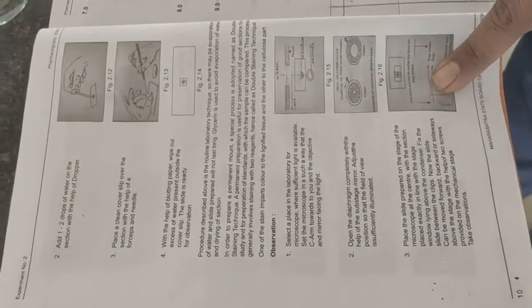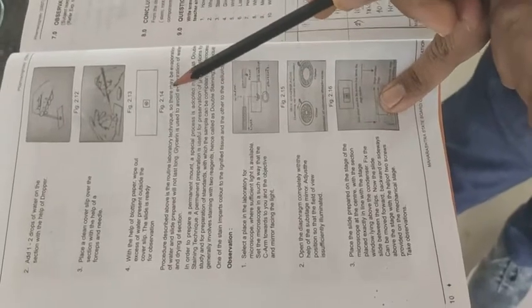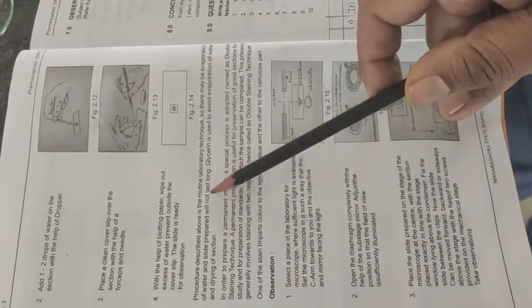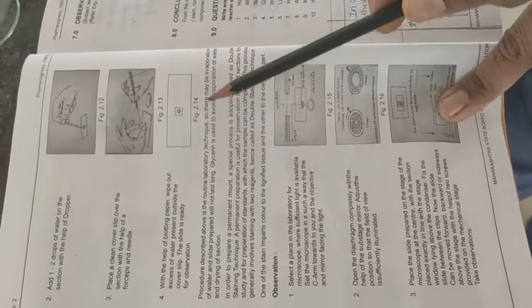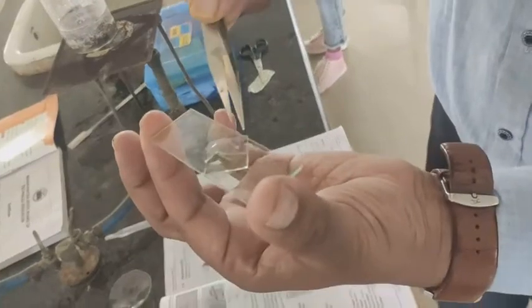This is the simple method to observe. Next, the important thing is that the procedure described above is a routine laboratory technique, so there may be evaporation of water and the slide will not last long. Glycerin is used to avoid evaporation of water and drying of the section. All of you know, with the help of a dropper we add water, but water evaporates.